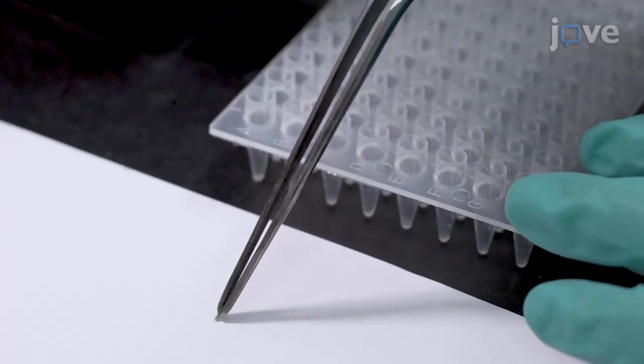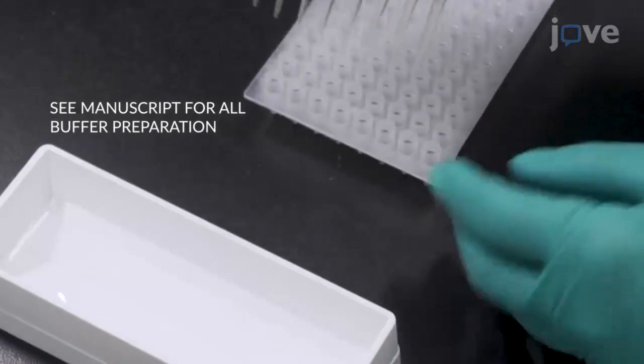To begin, place four leaf disks into each well of a 96-well PCR plate. Add 50 microliters of buffer A solution into each well.